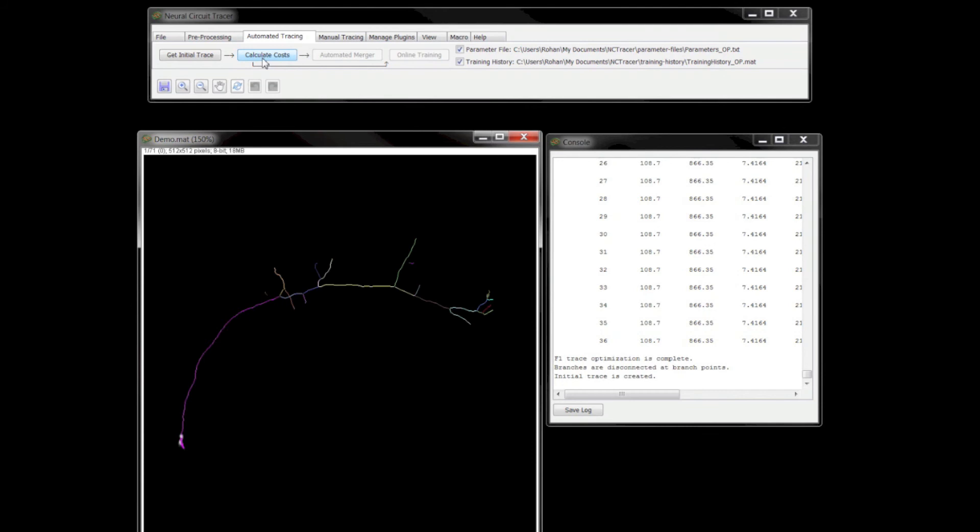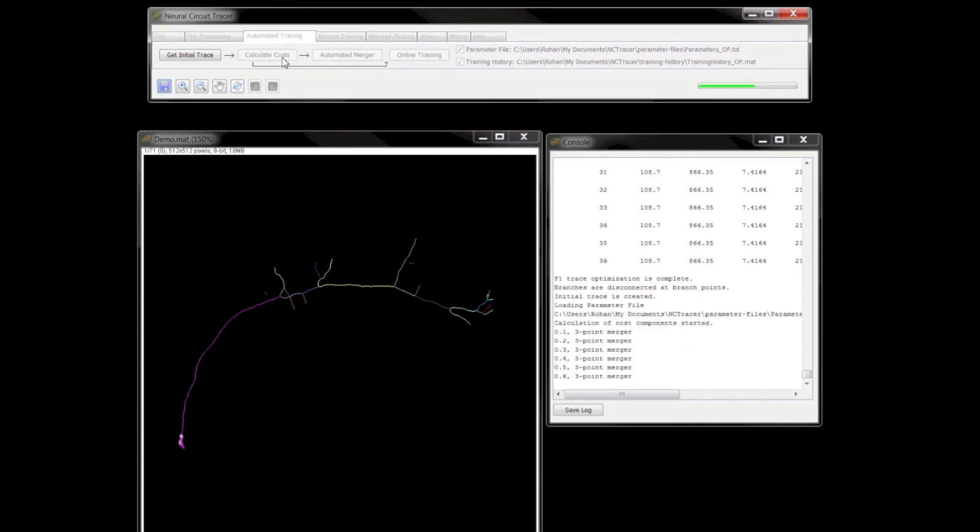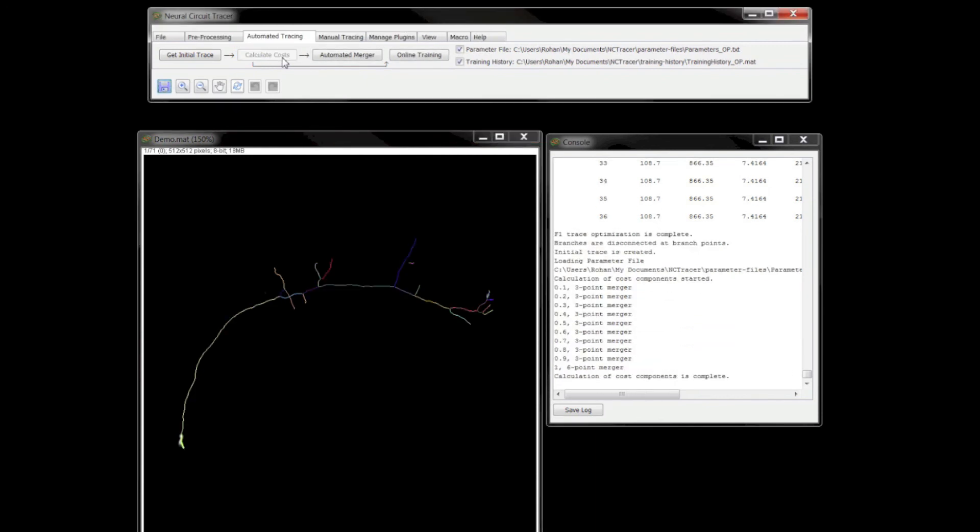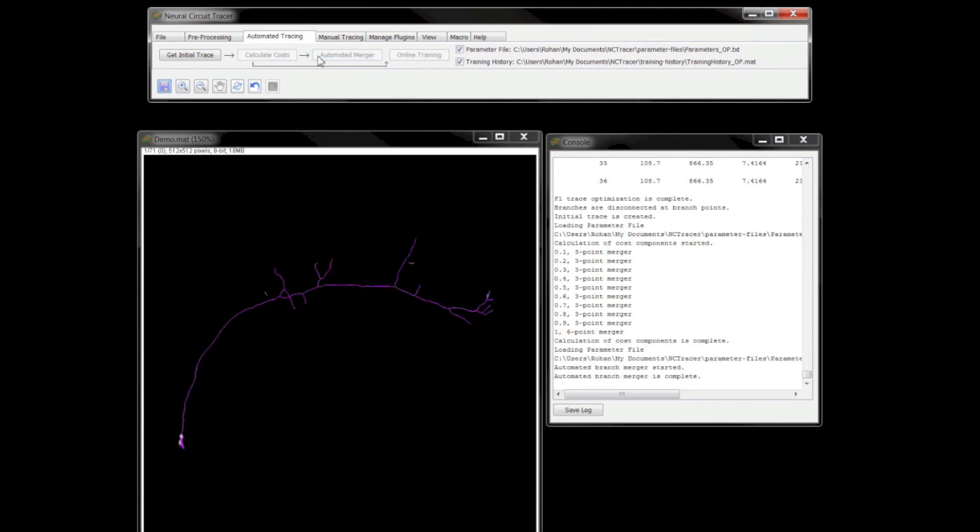Assuming training data has been saved in an earlier session, the Parameter File and Training History options let you load the data, which will be used in the Calculate Costs and Automated Merger steps by the algorithm to obtain the final automated trace.